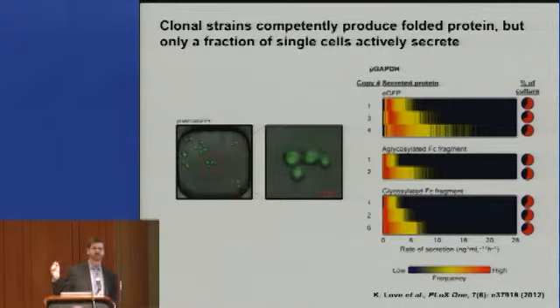You can sample this at different points in the reactor. You can sample it under different proteins. You can look at a whole wide range of different qualities of the production, and it turns out that you always have about 65% of the cells making this. Now, CHO cells, which are commonly used as mammalian hosts, we've also looked at this question. In that instance, about 80 to 90% make detectable amounts of protein. In this case, it's about 100 picograms per mil per hour as a lower limit of detection in this particular assay. But there's a discrete population that is not contributing to the overall reaction.